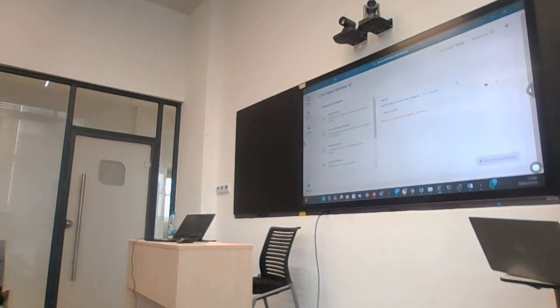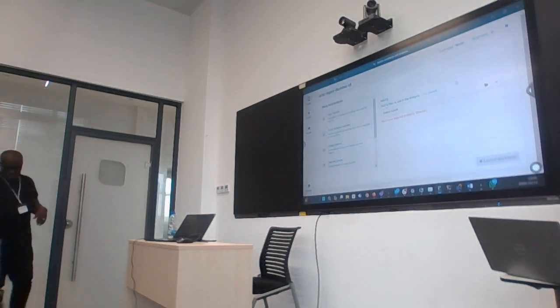Full of samples, and it will process each sample in the directory. Okay? Samples is two files, the forward and the reverse, but it will just process a whole directory. That's why I had you make a directory with just one sample, because otherwise I don't want to process all of the samples, right?